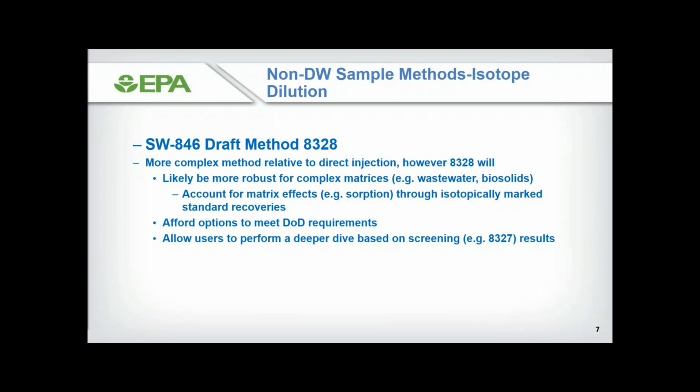We're working very closely with DoD, and you'll hear from Janice Willey later. That's our main contact there, to make sure that we provide a method that meets or can meet the requirements set out by DoD. This method could allow users to perform a deeper dive based on a screening type method, such as 8327, if a particular client or a particular user needs to do that deeper dive.